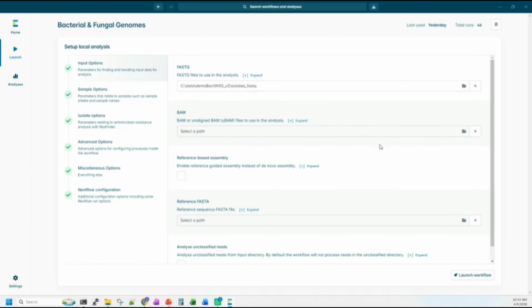So we do not need to run the analysis one by one, because most of the time we are able to multiplex maybe up to 24 samples in the Mid-ION flow cell or 96 samples in the PromethION flow cells. So if let's say we have 96 samples all requiring the data analysis, then these functions can help us quickly select our whole folder of the sequencing data, and then the analysis will be carried out for all the samples inside. So we don't need to run the analysis pipeline one by one.